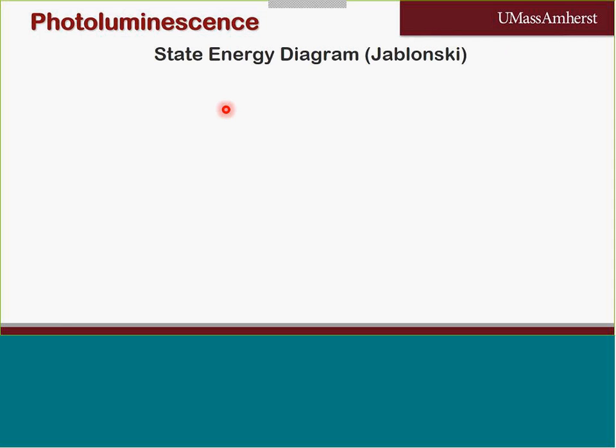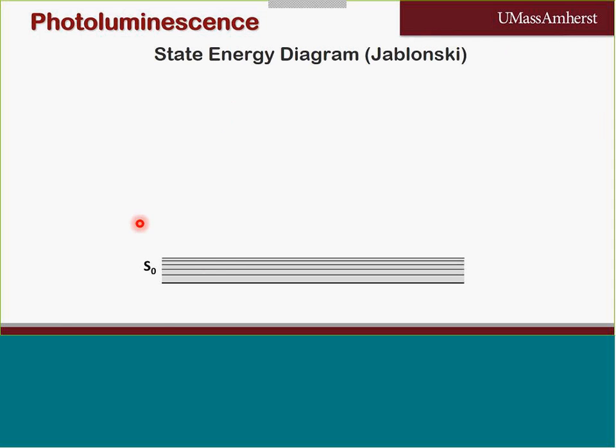So we are going to have a compound, or a particular molecule, that is at a ground state. The molecules that exhibit luminescence usually are aromatic compounds or are composed of conjugated dienes. That sample is excited by the addition of light.